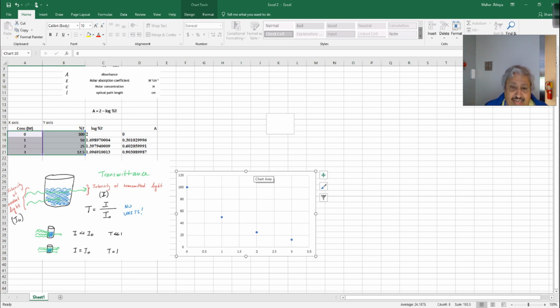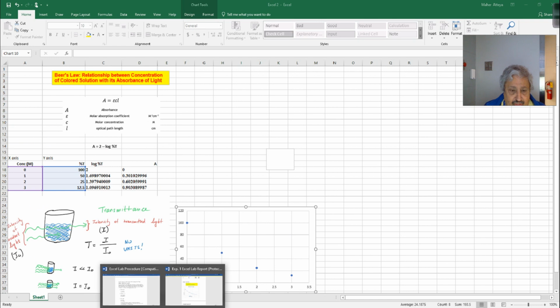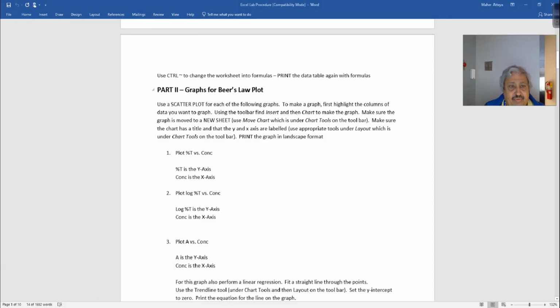But you can add a box here. That's what I did in the past. Or you can write on it. But sometimes if you write a longer one, I want to write. Let me just write the absorbance versus. Just hold on, I'll write it here.